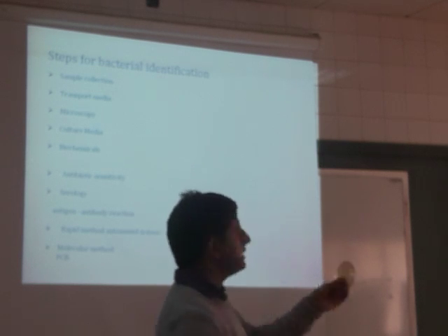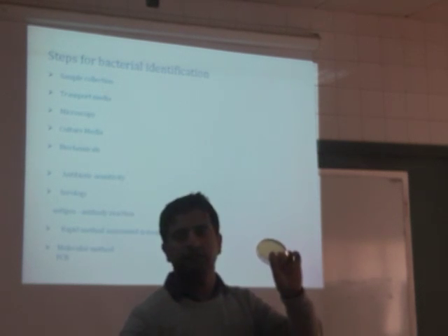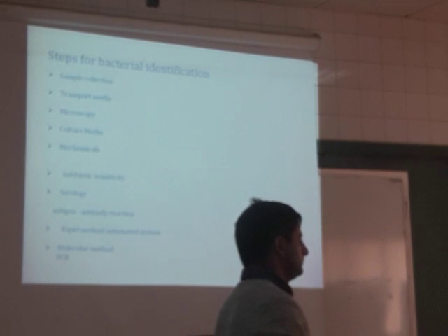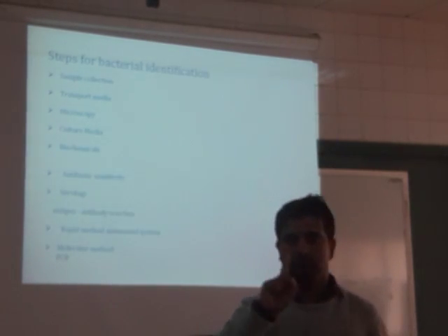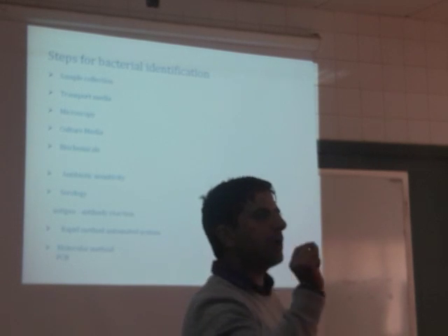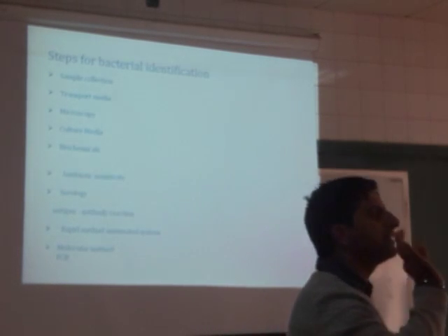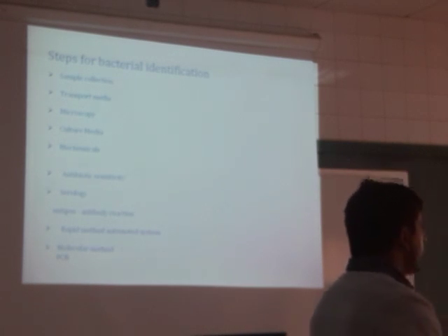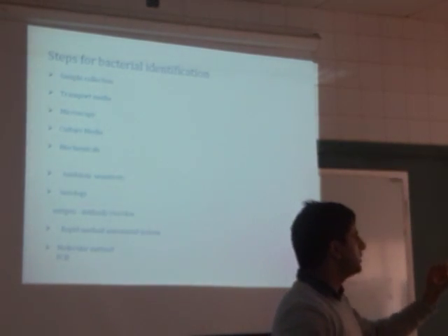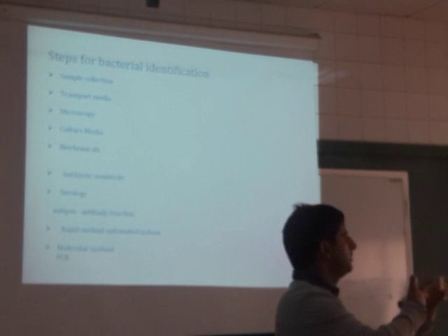So, why is agar here? Growth of the bacteria. Agar is a solidifying agent. Okay? If agar is not present here, it will not sit here. It will not solidify.